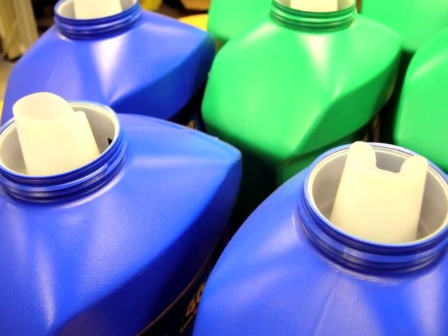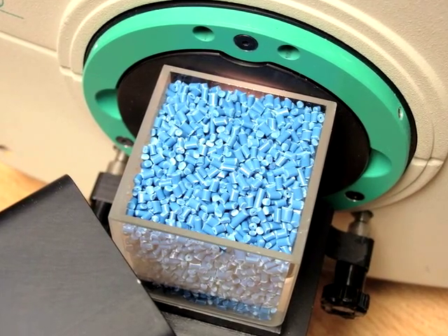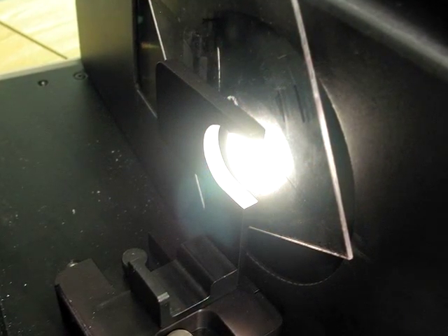HunterLab systems are ideal for checking the color, yellowness, whiteness, opacity, and transmission haze of plastic products.